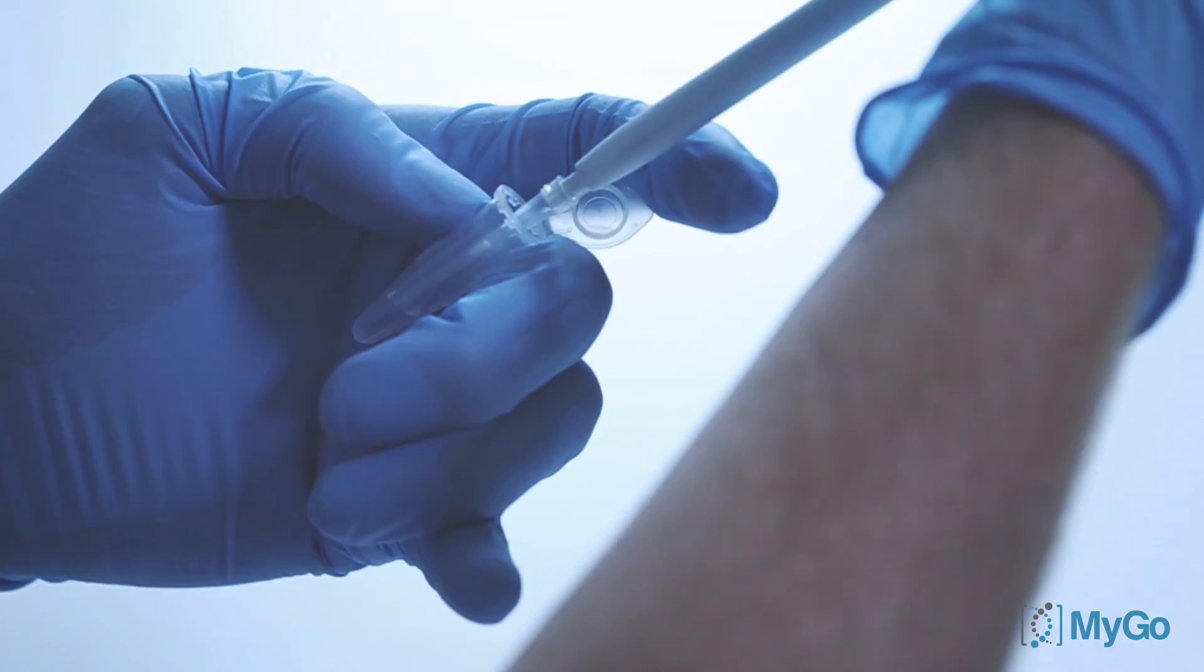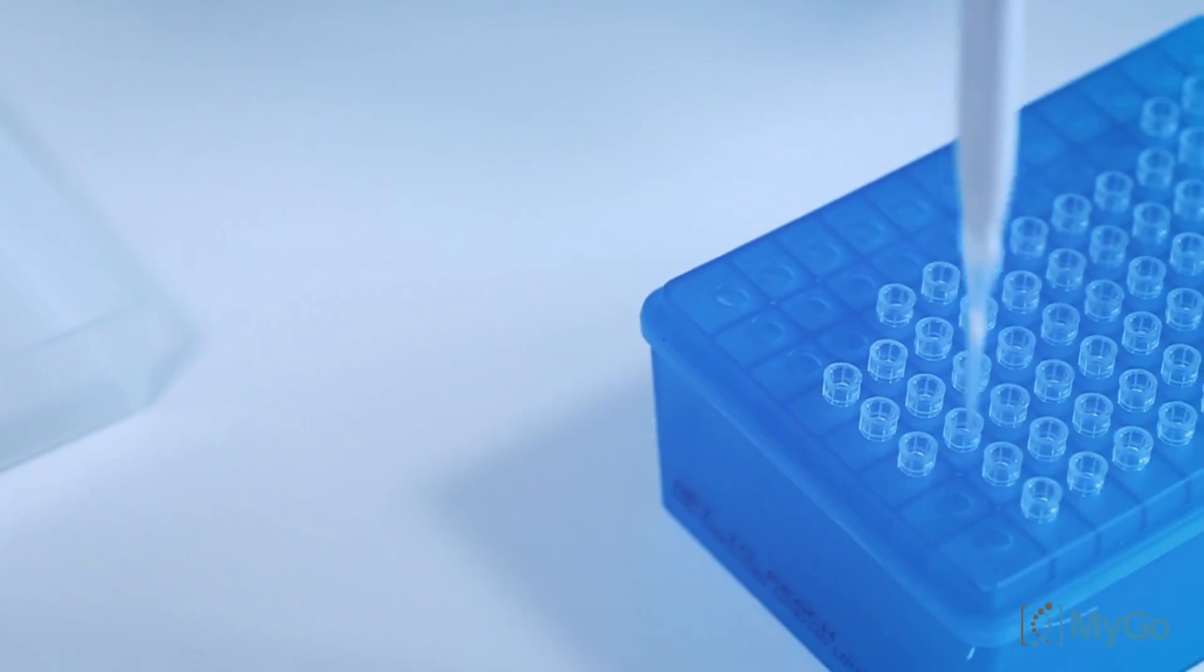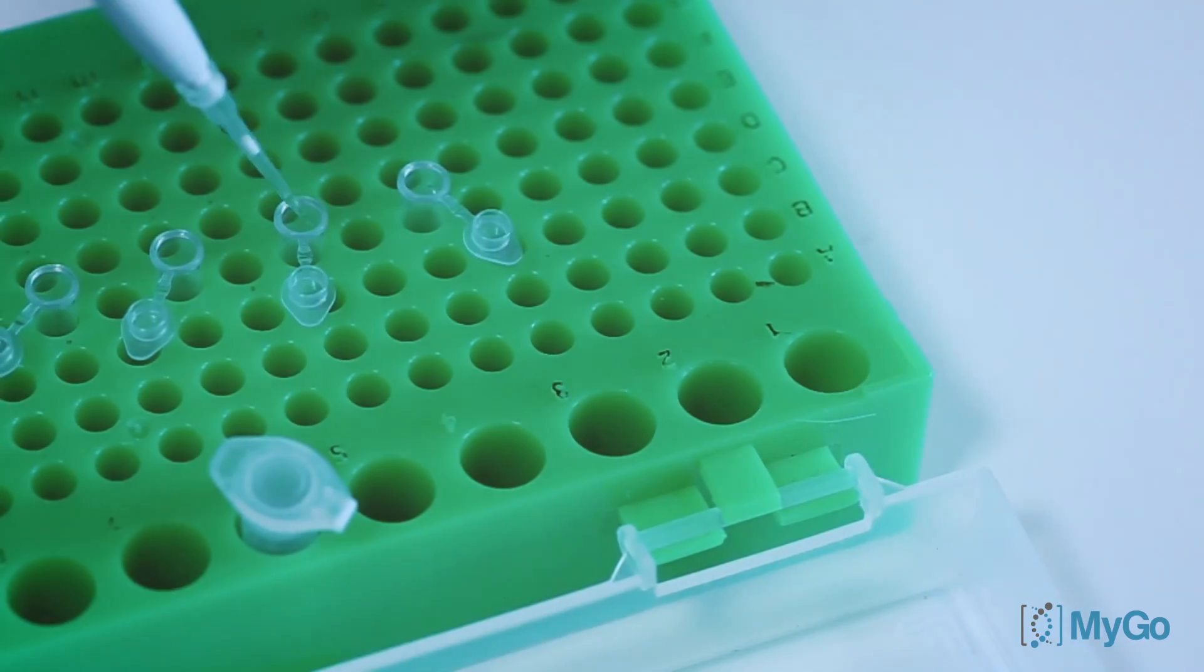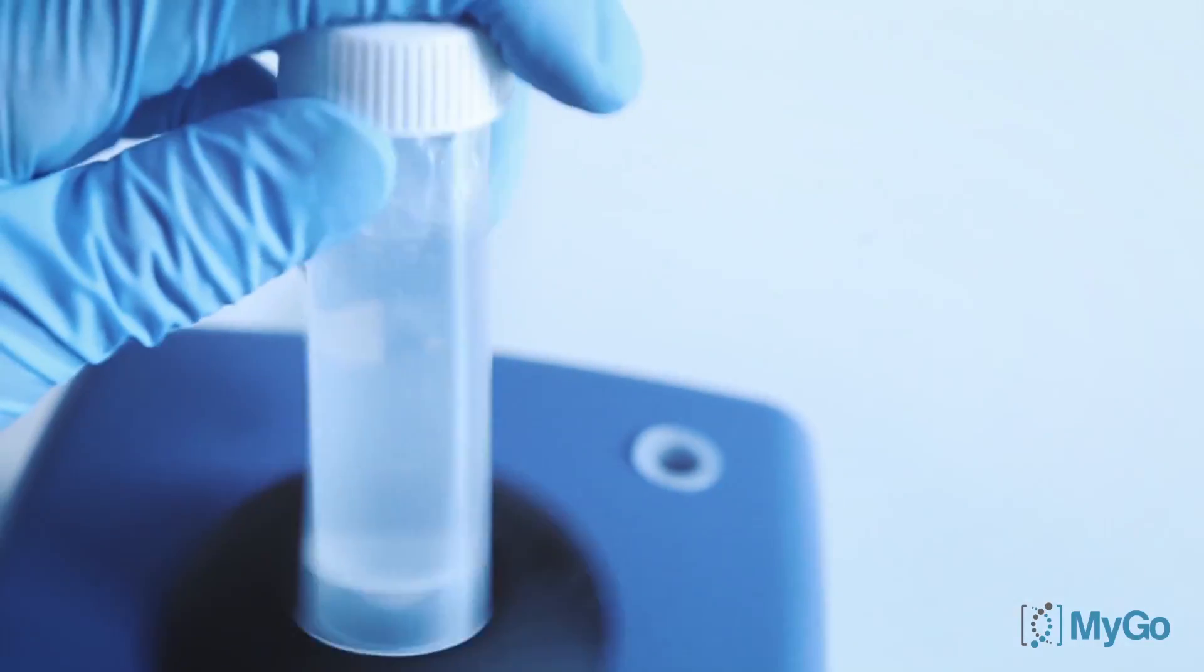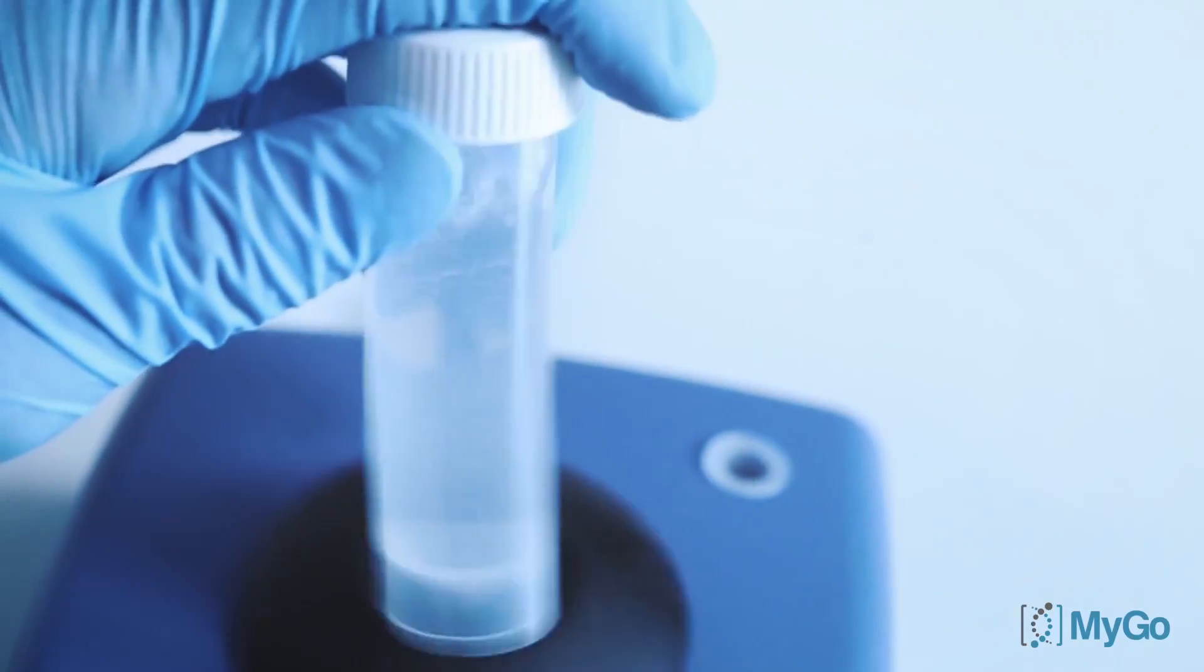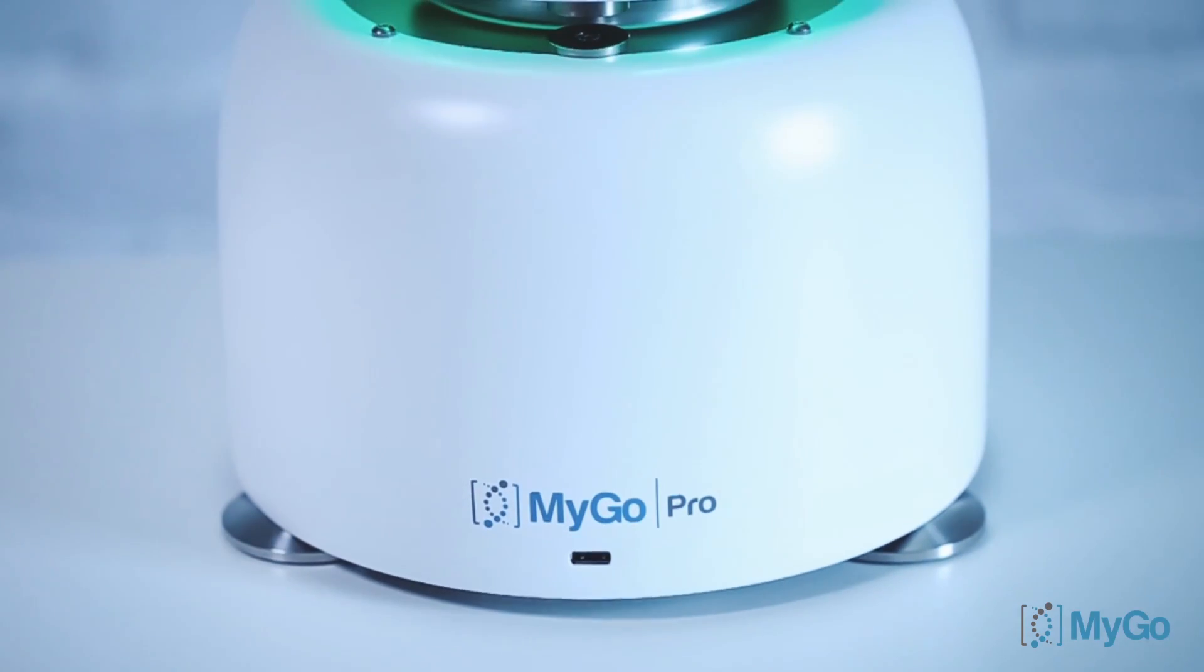In this first video we'll be looking at the MYGO5 demo kit. The MYGO5 is a QPCR demo kit aimed at demonstrating multiplex performance on the MYGO Pro. It's easy to use and contains all of the reagents you'll need to demonstrate a 5-plex QPCR reaction in the MYGO Pro.